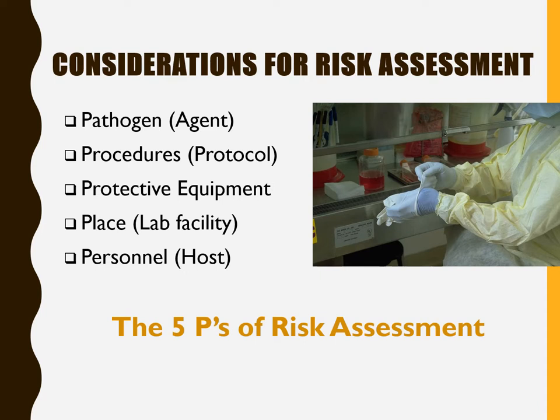Considerations for risk assessment. The first is pathogen or agent — what are the characteristics of the agent that make it hazardous? This is where the risk assessment starts. The second is procedures or protocol — the procedures being done with the organism in the vial, tube or petri plate, including addressing the biosafety level to handle the agent. The third is protective equipment such as biosafety cabinets, sealed centrifuge rotors, transport containers, biomedical waste containers and personal protective equipment. Are all the equipment operational and functioning properly, and are you trained to use it correctly?